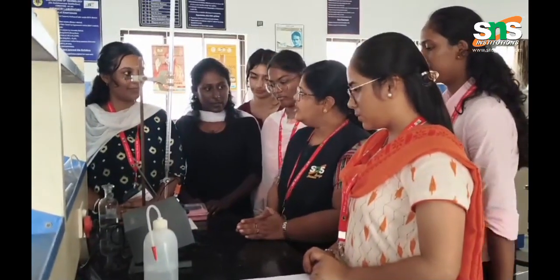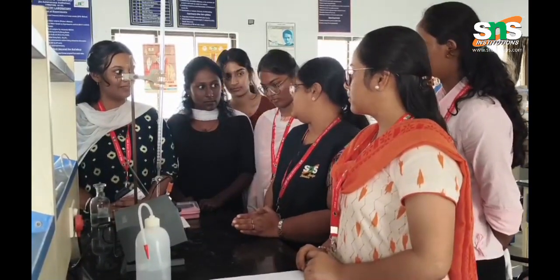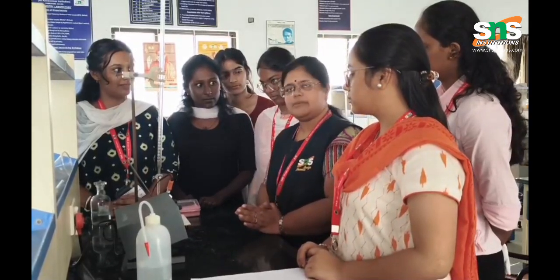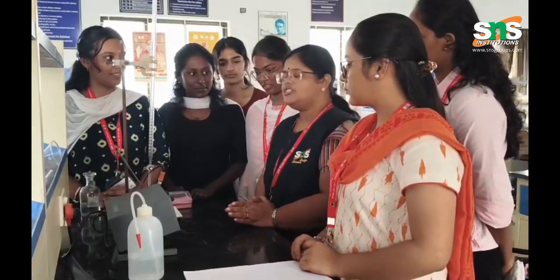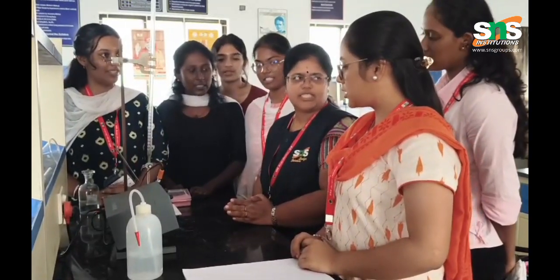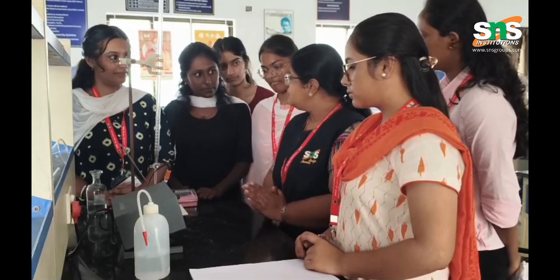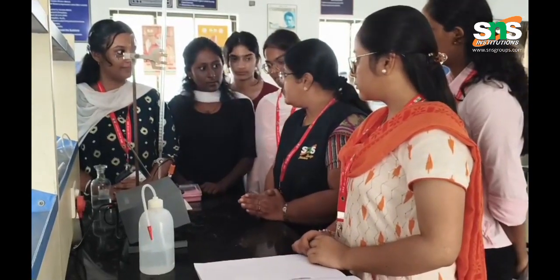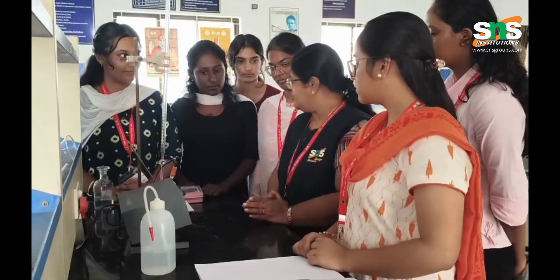Today we will see the conductometric titration for a mixture of acids. What is acid-base titration? What will happen when an acid is titrated against a base? What type of reaction? Neutralization. So the reaction is called a neutralization reaction. Here we are going to find out the amount of acid that is present, and for that we are using the conductometric titration.